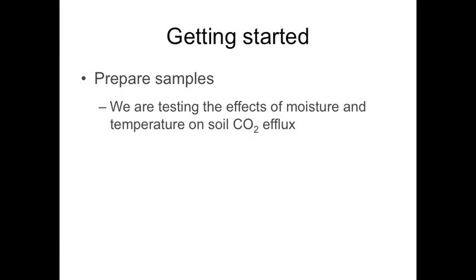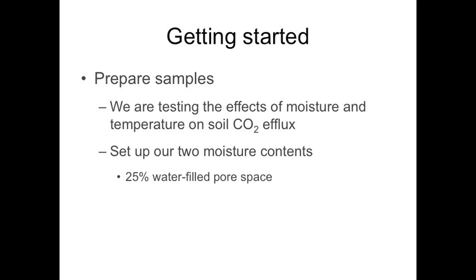We are testing the effects of moisture and temperature on soil CO2 efflux, so we need to set up our 2 moisture content treatments. The moistures we have chosen are 25% water-filled pore space, and 50% water-filled pore space.